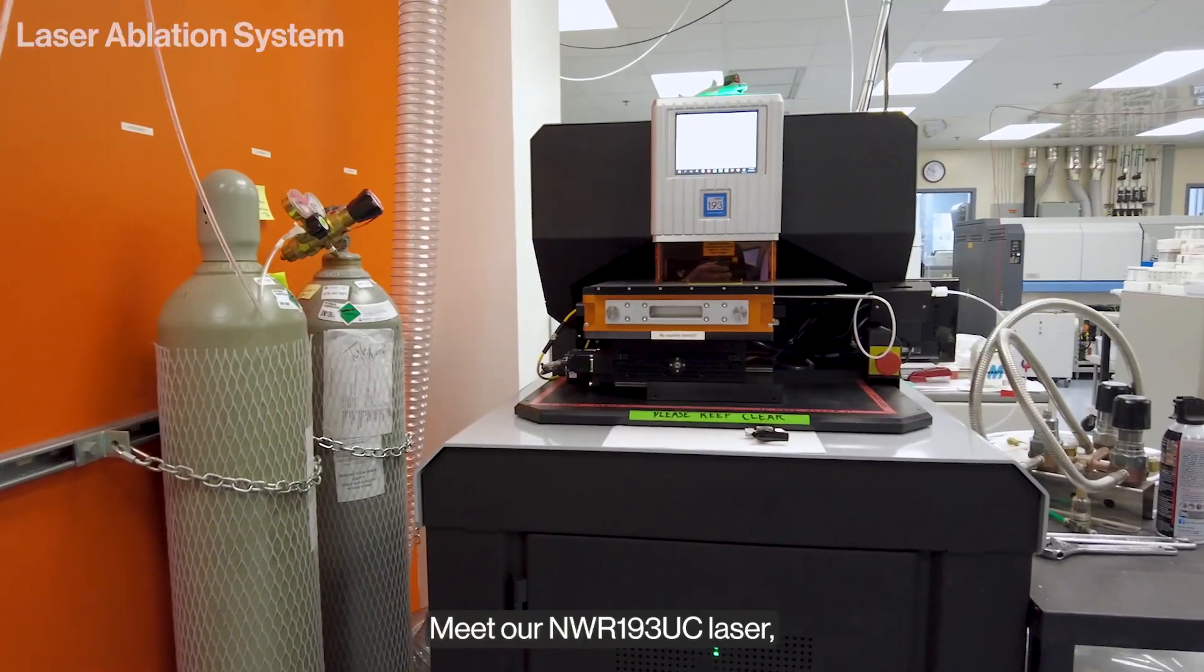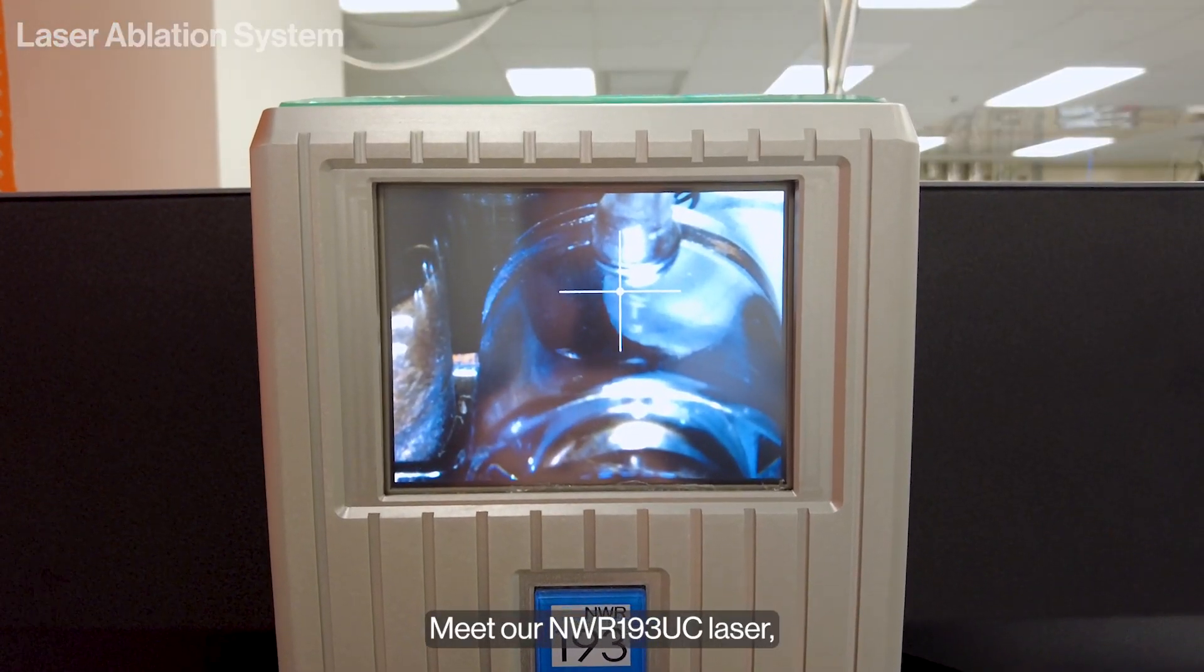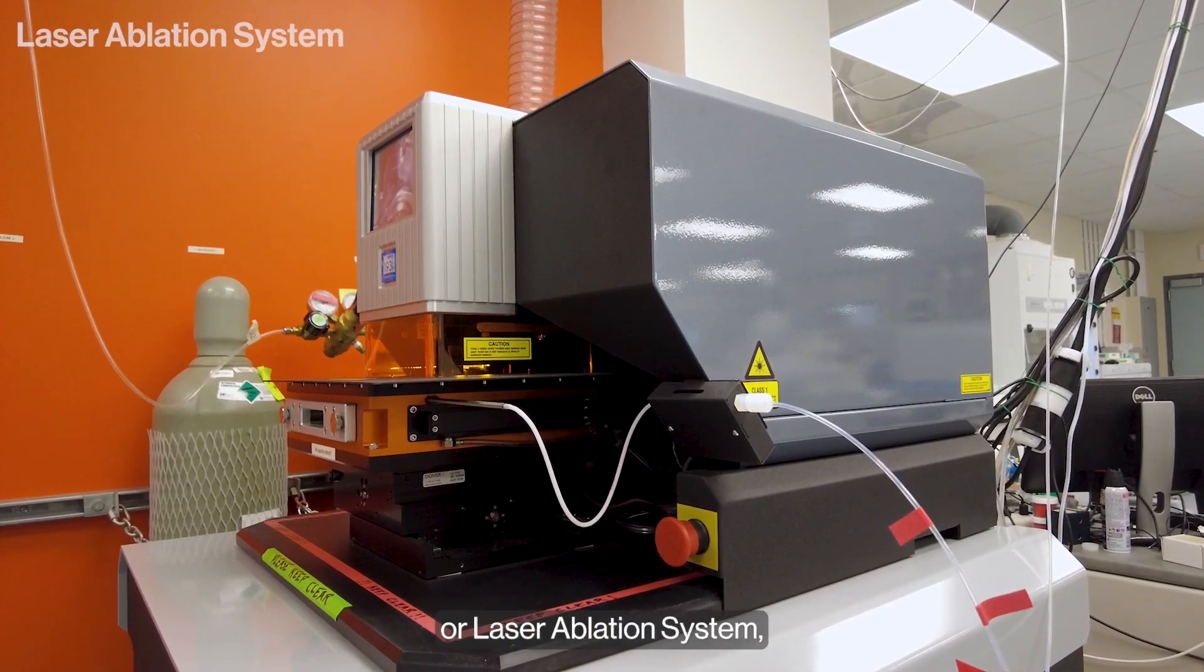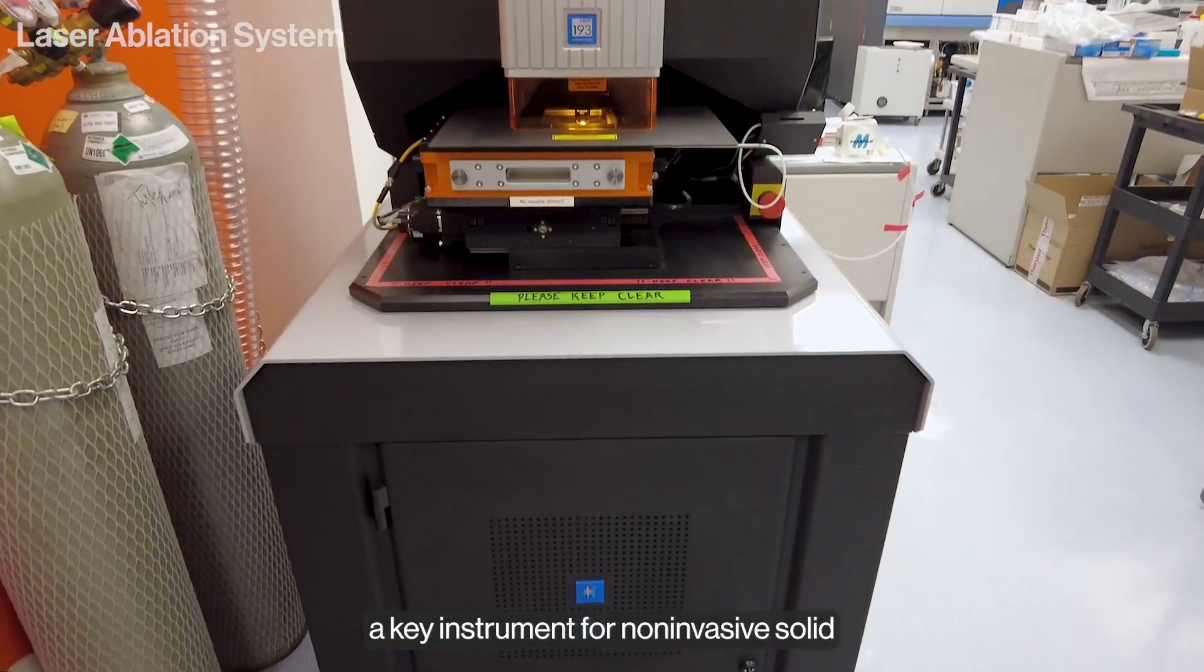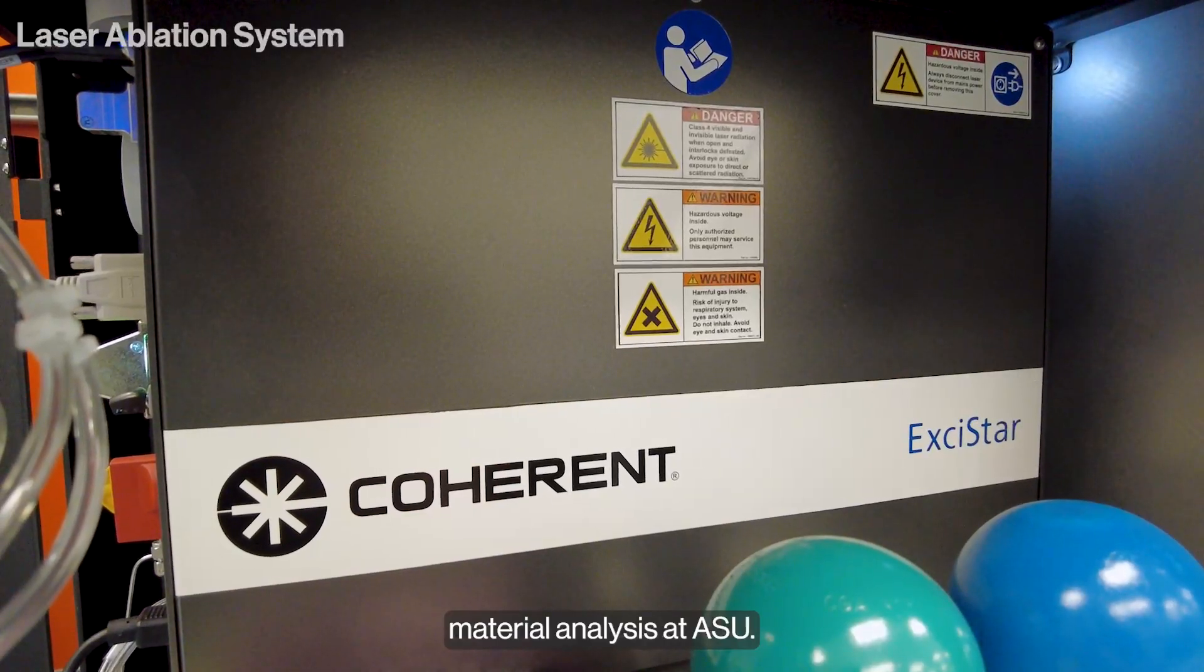Meet our NWR193 UC laser or laser ablation system, a key instrument for non-invasive solid material analysis at ASU.